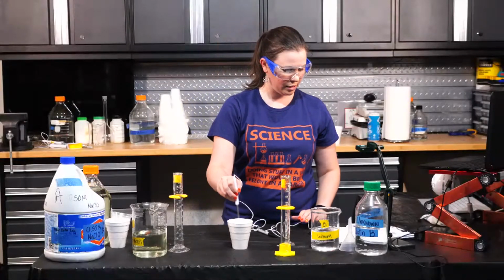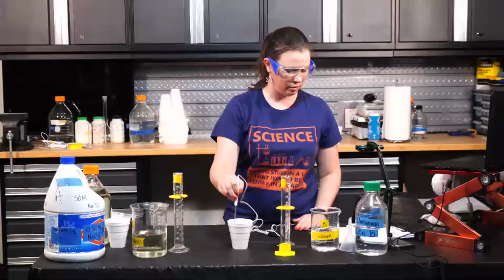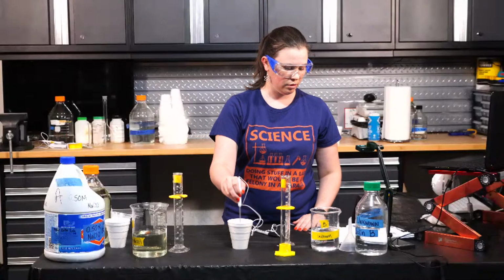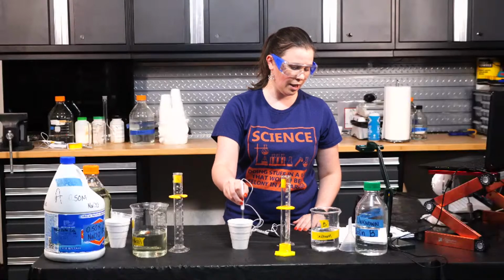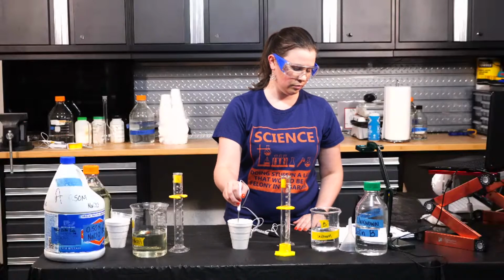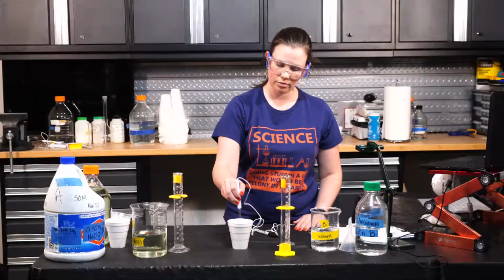22.4, 23.6, 23.4, 23.5, 23.6, 23.7, 23.8, 23.9, 24.0. And that seems to be our plateau, 24.0.